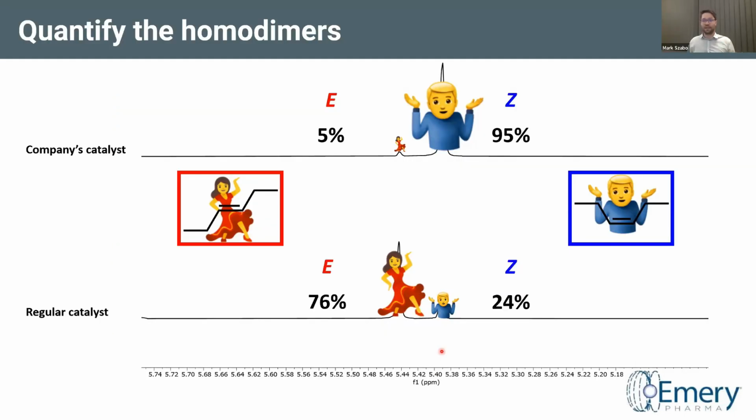Actually, I think there is no other technique with which you can figure out the configuration. So definitely LCMS or GCMS wouldn't be able to do it. If you have the Z configuration and you know that it's the Z, then you can measure a retention time and then you can use LC-MS or GC-MS. But to figure out which configuration is there, you need NMR.